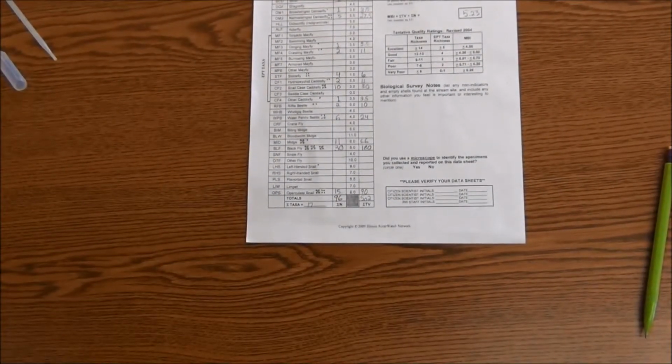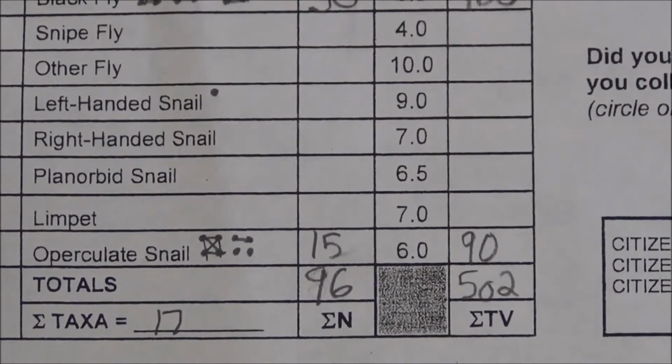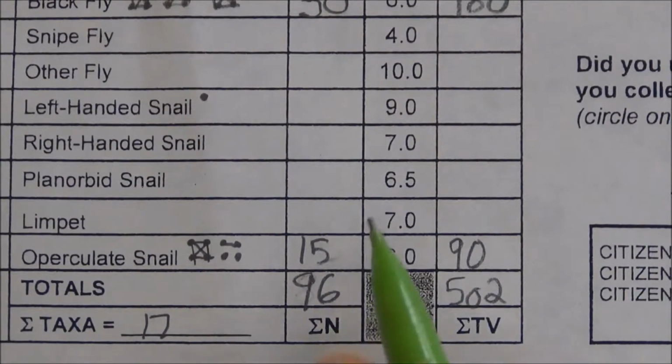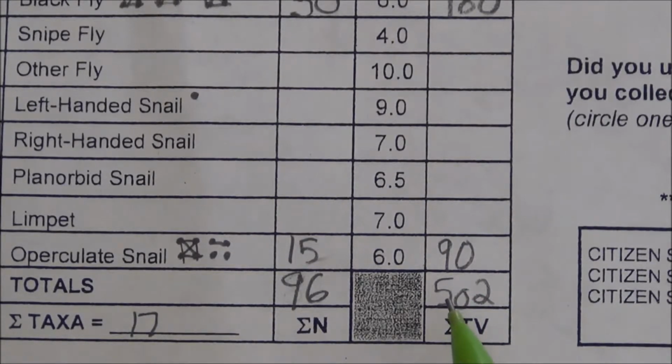Now that you have finished adding up your N and TV columns, you want to record the sum at the bottom of your data sheet in the sum columns. Right here, 96 was the sum of our N column. We added up how many of each kind, and we had 96 total macroinvertebrates in our sample. Then we added up the TV column, which is the tolerance value product. So if you multiplied 6 times 15, you get 90. You add up all of those and record the sum of your tolerance value column right down here, so 502.